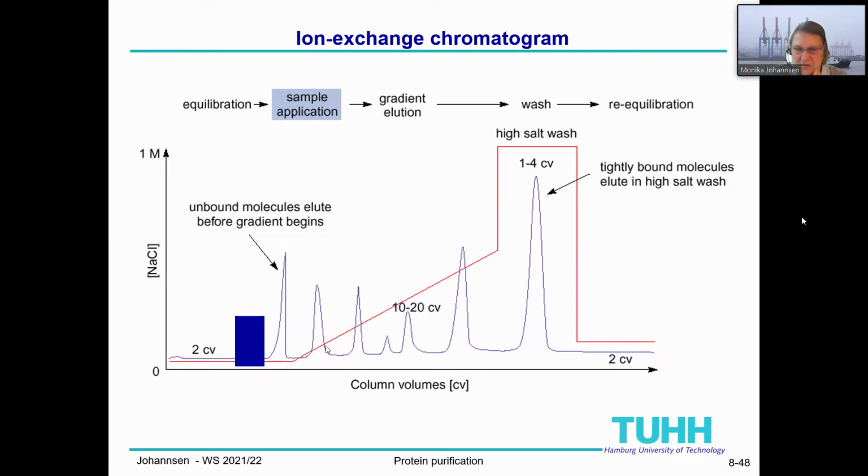We could also do a step gradient in this area, but usually it's run like that. And of course we also need the re-equilibration time to come back to the low salt concentration in order to enable the binding of these proteins here. If we would go on with a very high salt concentration for the next injection, of course everything will elute directly.